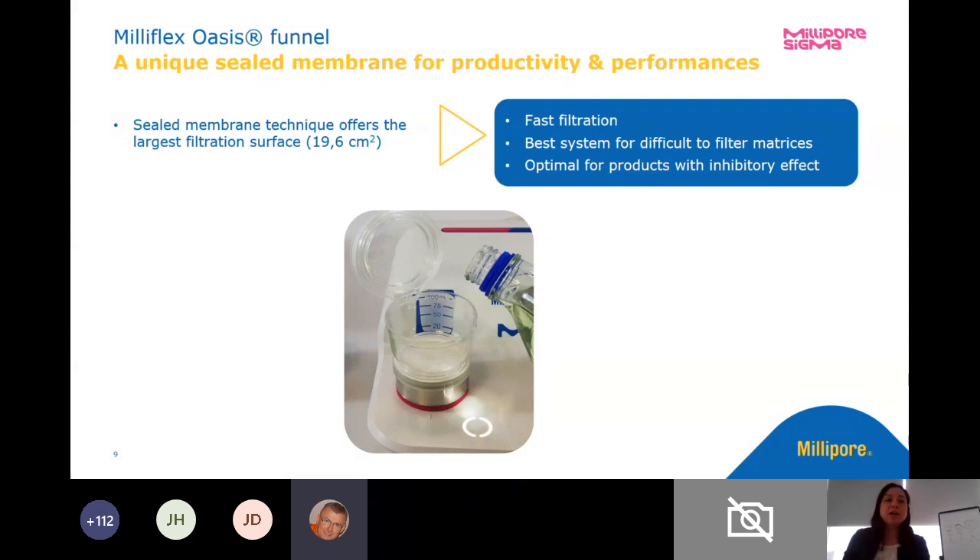We also have a unique sealed membrane. The membrane is integrated into the base of the funnel — there's no manipulation of that membrane. It has the largest effective filtration surface area. This aids in fast filtration, minimizes any potential colony overlap if you have high bioburden, allows you to see everything on the grid better, and is better for more difficult to filter samples and for any rinse fluids applied afterwards.